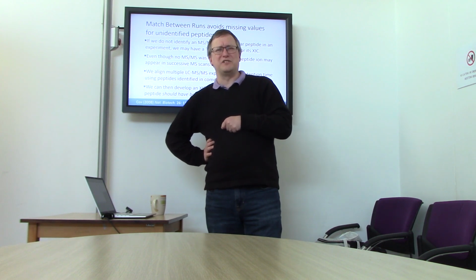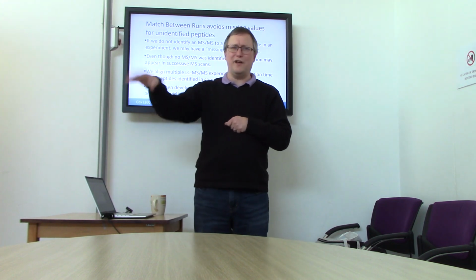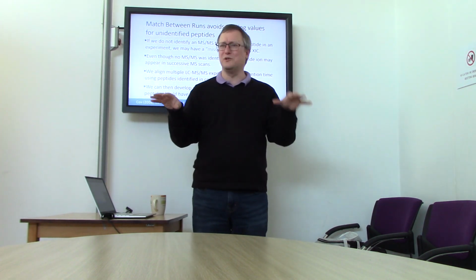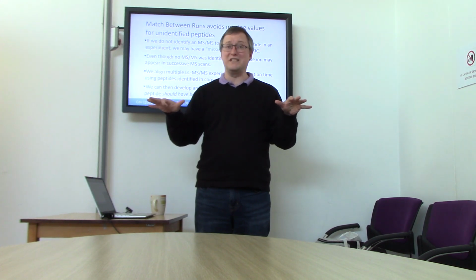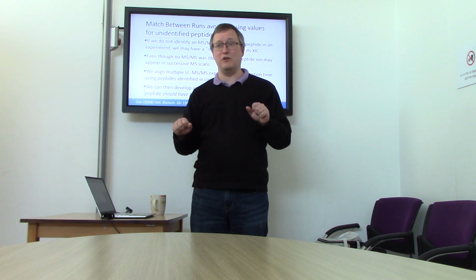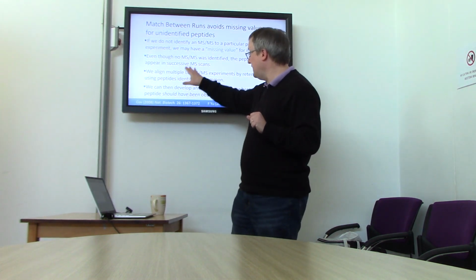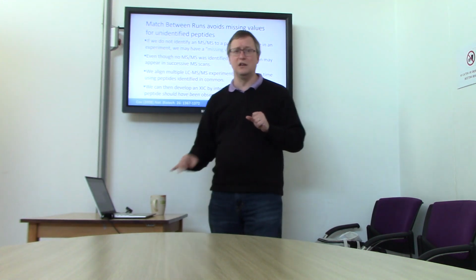What does that look like from a statistical point of view? Well, I want to compare these 5 values for the peptide to these 5 values for the peptide, and now one of them, we didn't identify it. Well, that's a problem. And that's what match between runs is all about. Match between runs was really popularized by some software called MaxQuant, published back in 2008.